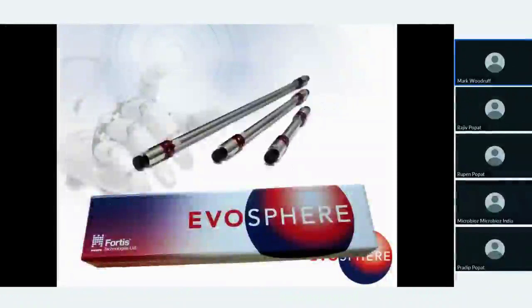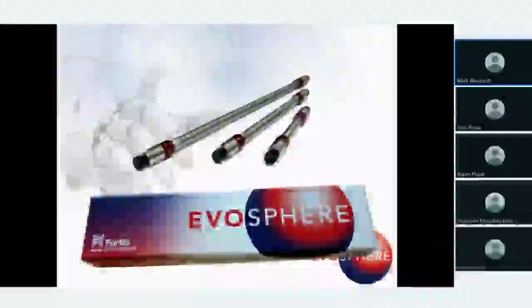So hopefully you've seen some of the advantages that these stationary phases give us. I've also talked a little bit about gaining resolution from our efficiency. So by moving to a monodispersed, fully porous particle, we gain efficiency somewhere in the region of 50 or 60% over what we have traditionally been getting on 5 micron and 3 micron and 1.7 micron particles.